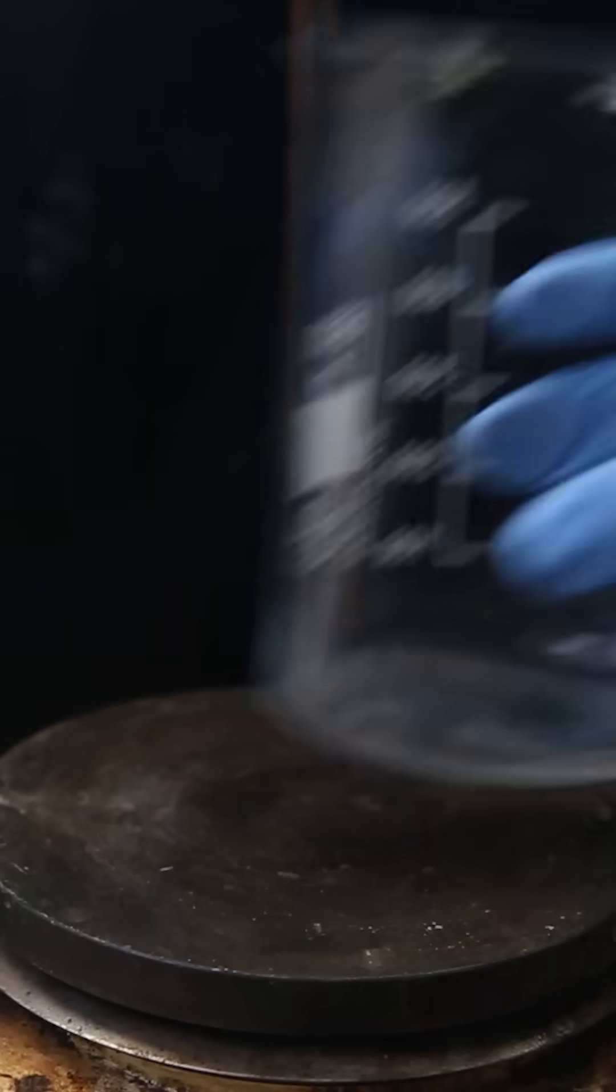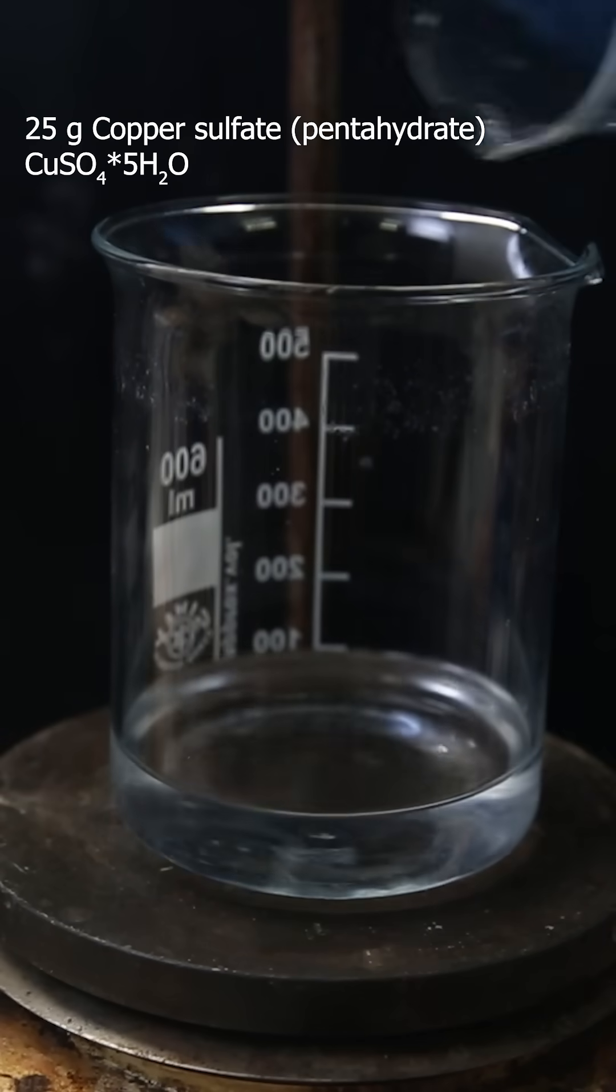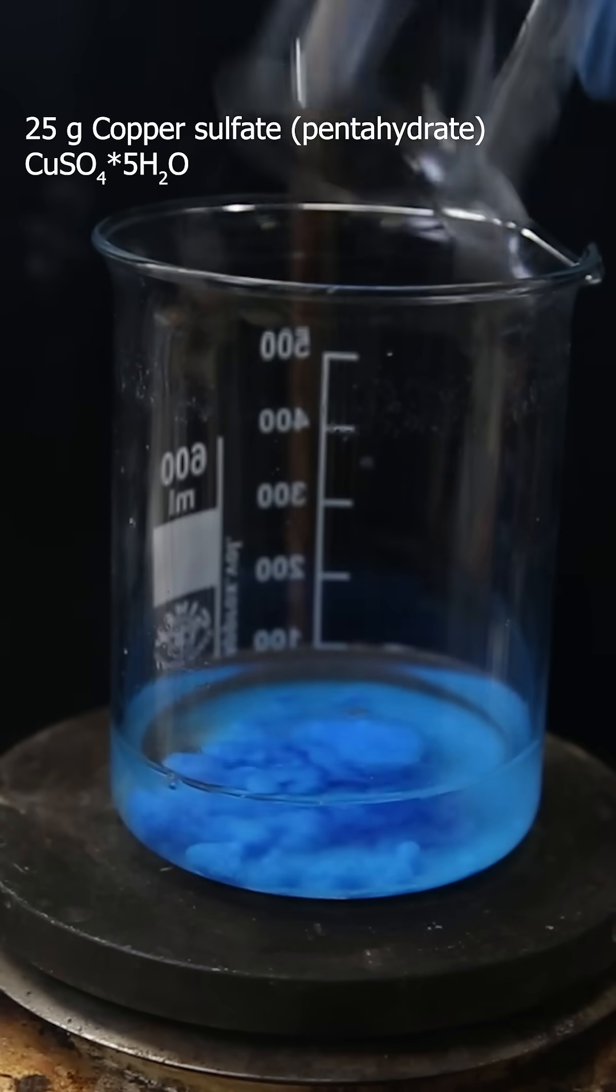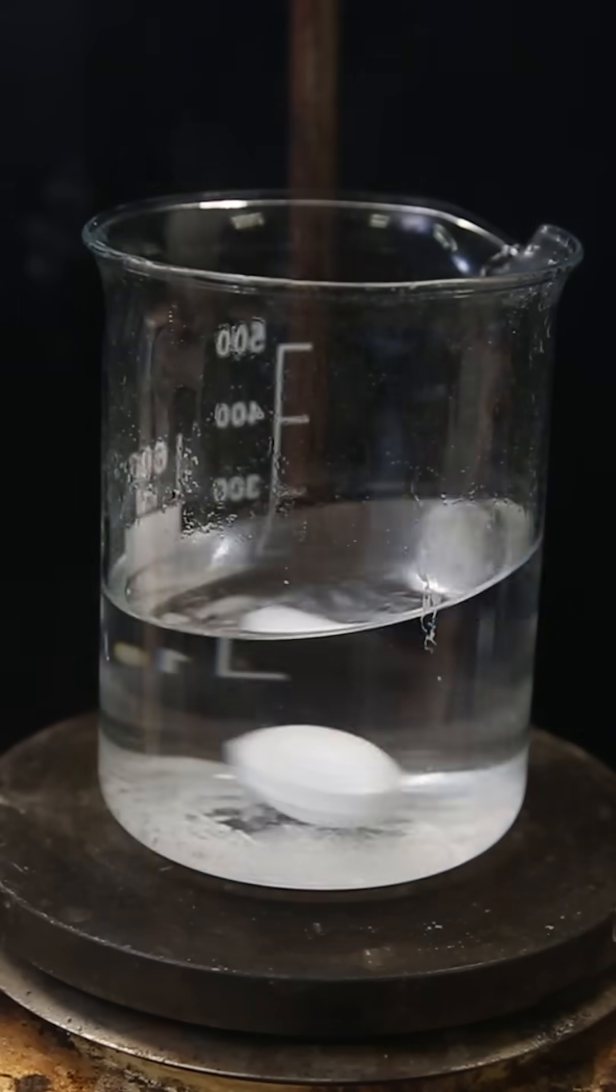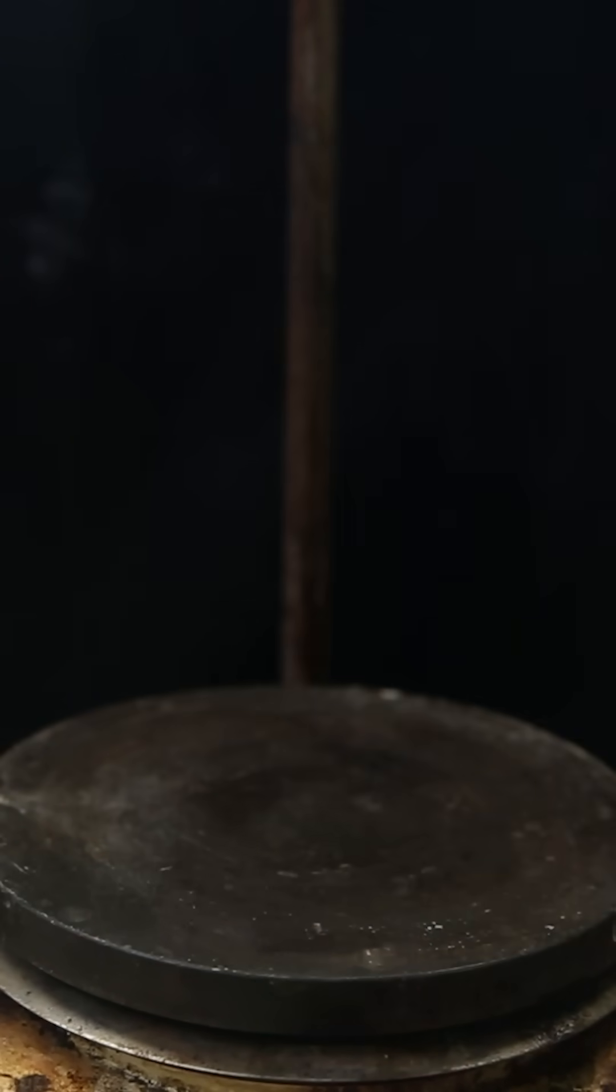I set this aside and then set up a new beaker with heating in which I add 100 ml of water and 25 grams of copper sulfate. When it has dissolved, I combine the two solutions. Nothing happens yet and I set this aside.